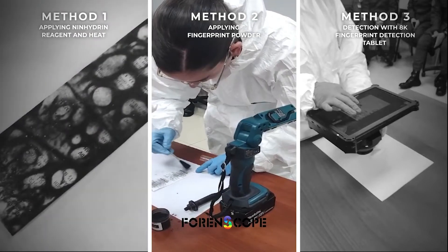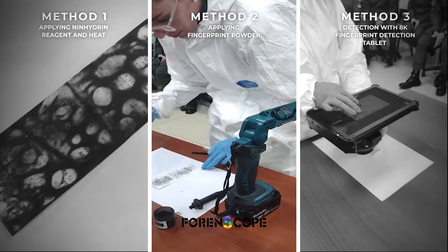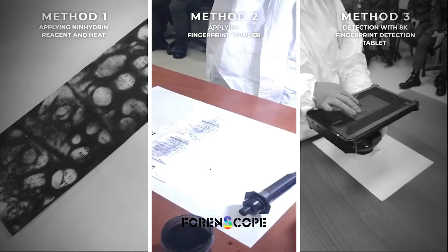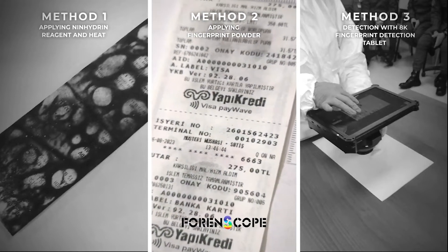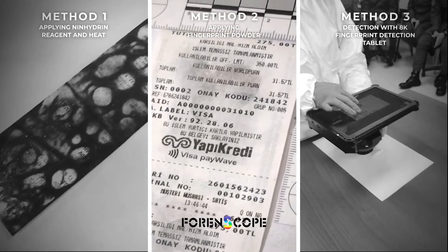Here was used one of the most antique methods for fingerprint detection: applying black fingerprint powder. The method of using powder to reveal latent fingerprints entails applying a finely powdered substance onto the finger mark impression, typically employing a glass fiber or camel hair brush. This powder adheres mechanically to the sweat residue, highlighting the ridge pattern.